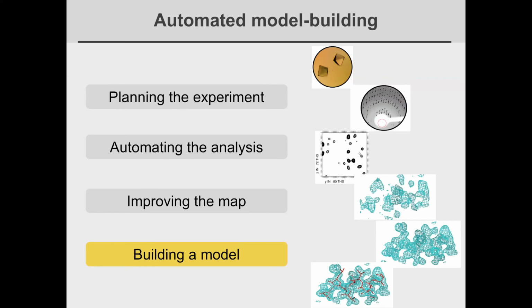So then there was another question from a user who has 3 out of every 7 residues not a natural residue, non-standard, I guess. How do you use that in Autosol? Is there a way to handle that? Wow. So no, we don't have a... so I'm going to assume that we're talking about peptides, but the side chains are non-natural. Let's suppose, I'm just guessing that that's what we're talking about.